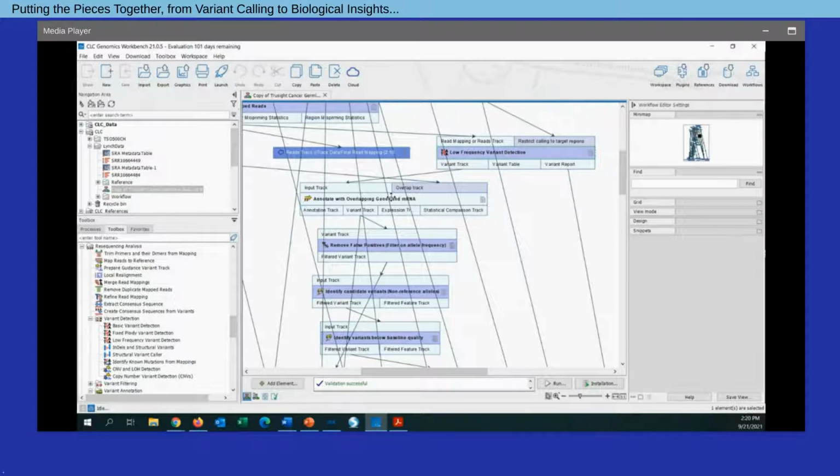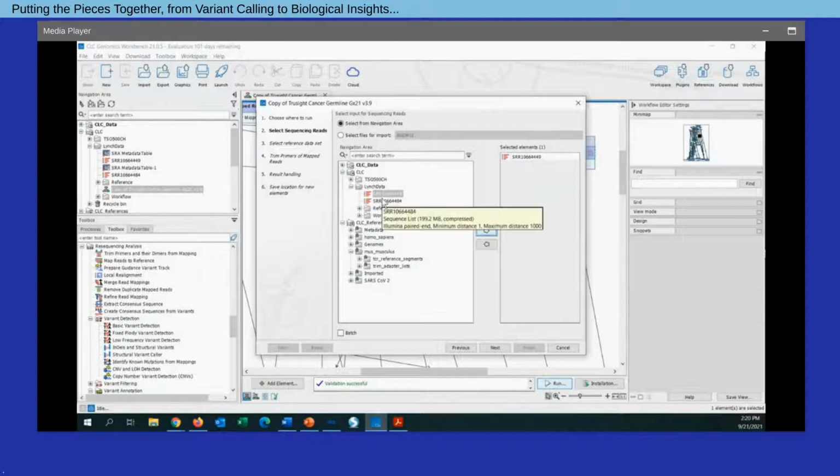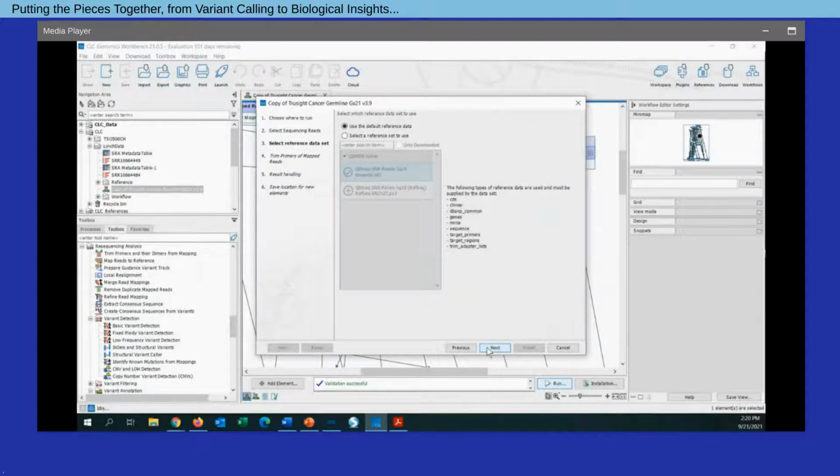So at this point, if I'm ready to run the workflow, very simply what I would do is come to the bottom right corner here. I would click the run button. And now we'll essentially walk through a dialogue where we can take one of our samples of interest, or I could take multiple samples and batch them. And then all the available parameters that we need to enter can be selected throughout this dialogue.